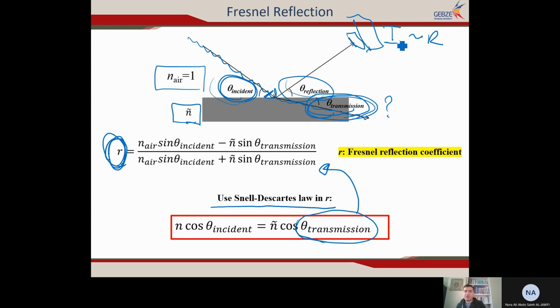Reflection from the surface, or intensity, is recorded at the detector. And I am looking for the behavior of the X-ray reflectivity curve. Why does this reflectivity, why does this intensity, decrease with this 2 theta? So I would like to search this one.